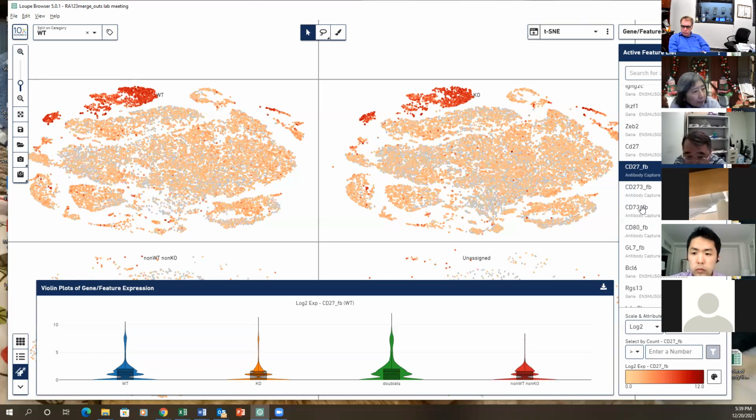I think tonight when I go home, it should be downloaded. Then you can see the way I separated the populations. Download your version, save this and put it in your drive, and Shannon, you do the same, and then we'll look at it. The way I separated, you may not like it, so you can check each population. There's an easy way to reverse. If you don't like it, you can reverse.